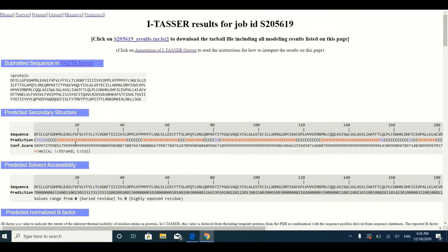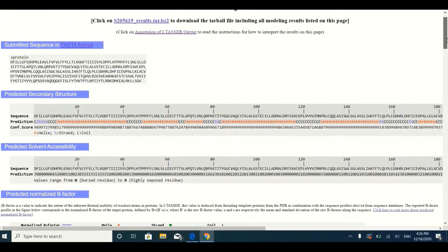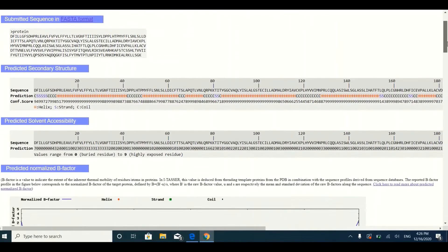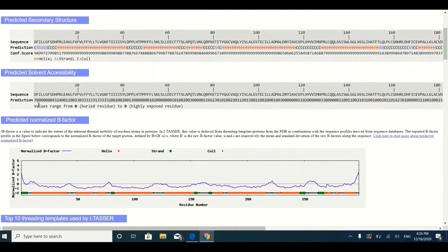If the confidence score is near to 10, it means that the prediction accuracy is very high. But if the score is near to zero, it means that I-TASSER is not very sure whether that polypeptide part is going to form that particular secondary structure. The next portion gives you information about solvent accessibility.